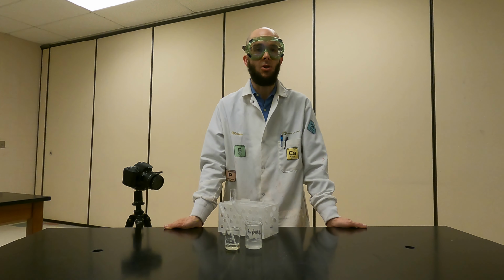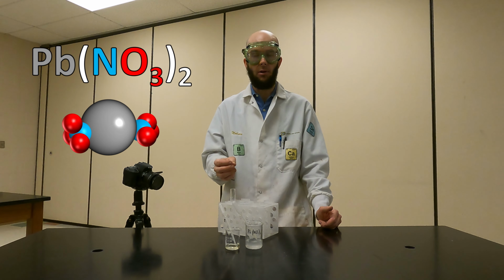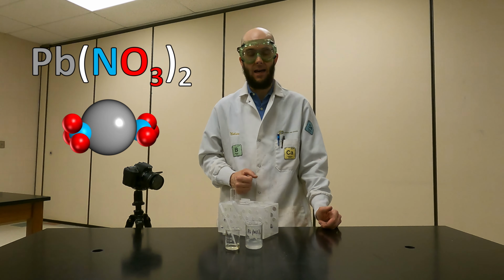In a double replacement reaction, you always begin with two ionic compounds dissolved in a solution, often water. When an ionic compound dissolves in a solution, we call that state of matter aqueous. So in an aqueous solution, you have a mixture of positively charged ions, those are called cations, and negatively charged ions, we call those anions. So in the example that I have here, I have lead nitrate. So I've got my lead, which represents the cation in this example, and the nitrate, which represents the anion in this example. And I'm going to react my lead nitrate with some potassium iodide.